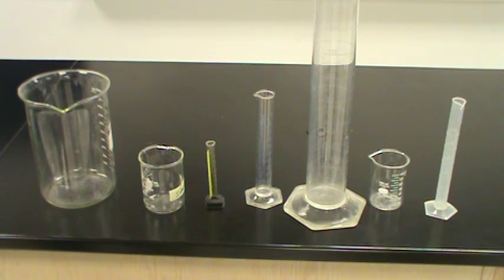The final form of measure that we're going to get into before we move on to the next thing on our list of things to learn about in science in the sixth grade at Dexter Middle School is what we call volume measure.